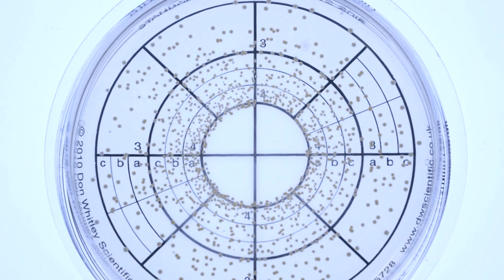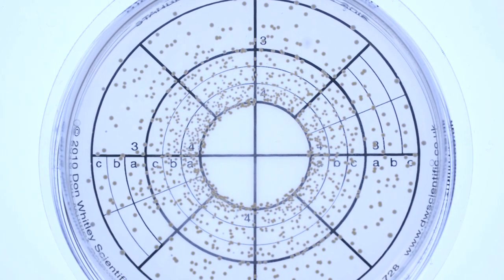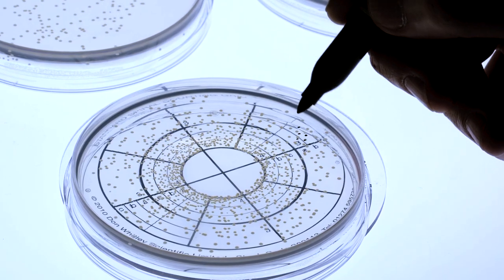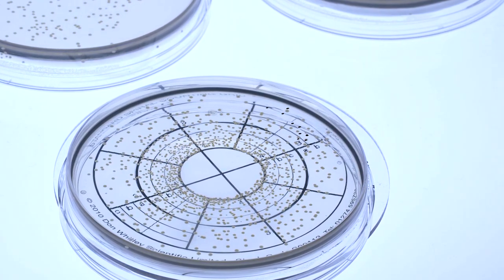The process of counting colonies on spiral plates is often quicker and more accurate than reading conventional spread plates or pour plates. Only sectors of the plate that have discrete colonies need to be read.